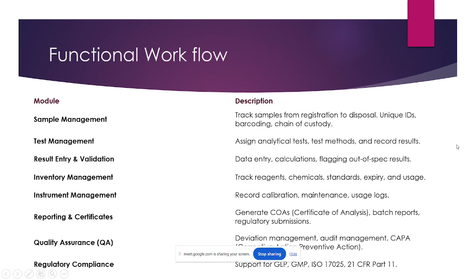And then coming to the result entry and validation. Once the sample is generated and the test is assigned, components will be created there in the test assignment. Under the test, the components will come. I told you that in master data creation time we create the components as per procedure with some data types. Based upon the data types, the data entry fields become visible, so we can enter the data there. This is the end user workflow. Result entry will be taken care of by the end user, because he has to prepare the samples and perform the testing, so that's why he has to do the result entry.